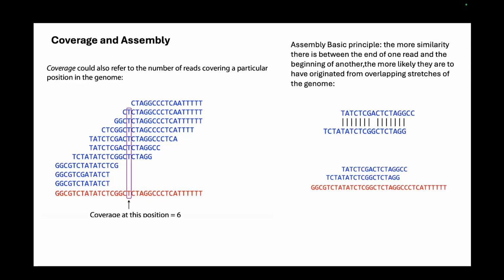As we know from the different genomics pipelines that we've learned earlier, one step in the pipeline is you get the reads, do quality control using different tools, and then ultimately you align the reads with a particular reference genome. After alignment, you can see the gaps in the genome, the kinds of mutations that have occurred in your sample compared to the reference one, and what the variations are. You can check that.